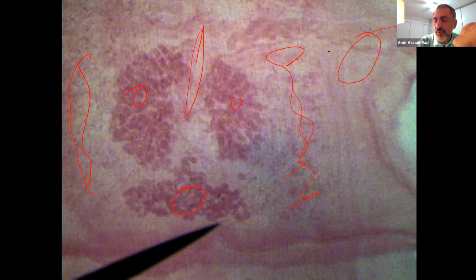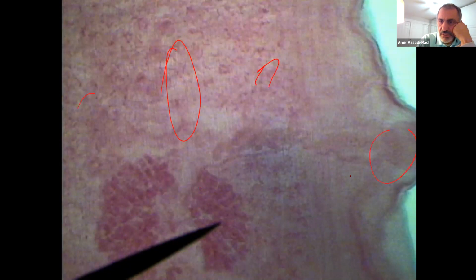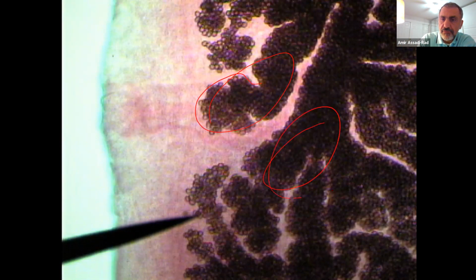And this is a mature proglottid. What stage, I might ask? This is a mature proglottid, not a gravid or ripe proglottid. So same thing again, uterus up here a little bit, and then everything is testes, and of course your genital pore. So this is the gravid or ripe proglottid. If you look at the uterus, it's full of eggs.